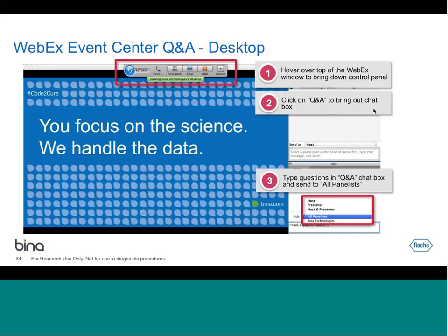For PacBio, I wouldn't expect this feature to be useful. There will be many more mismatches. Also, each read sometimes has different read lengths. So basically, that's a totally different kind of data set. If we try to apply it to PacBio, we may need an entirely different set of features that's better suited for PacBio.